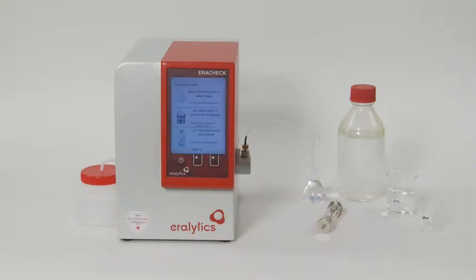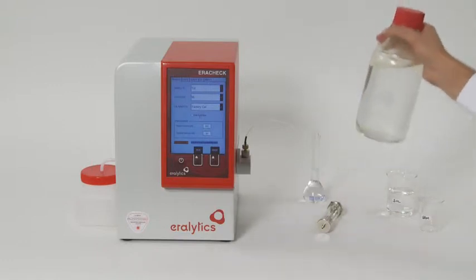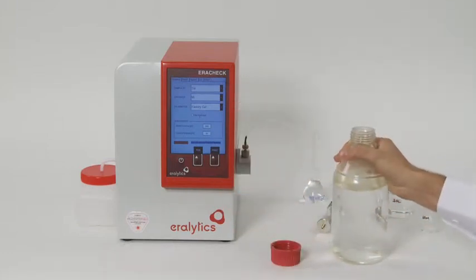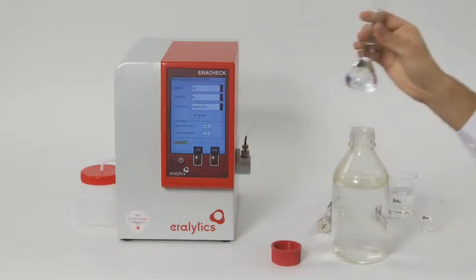In the first step of the measuring procedure, the hydrocarbons are extracted from the water sample. This is done by a liquid-to-liquid extraction using cyclohexane or cyclopentane as a solvent. We recommend collecting 900 millilitres of water sample into a glass bottle with a PTFE cap. Prepare 50 millilitres of solvent in a volumetric flask.